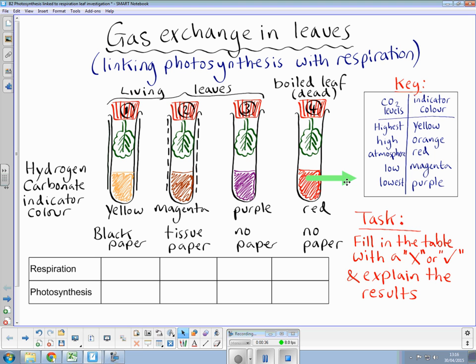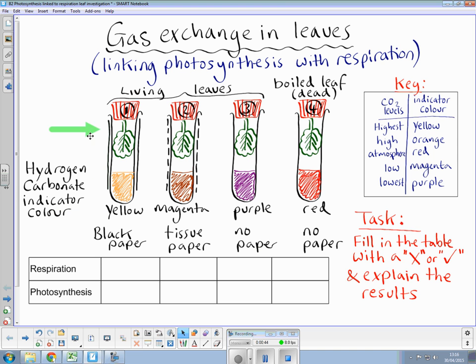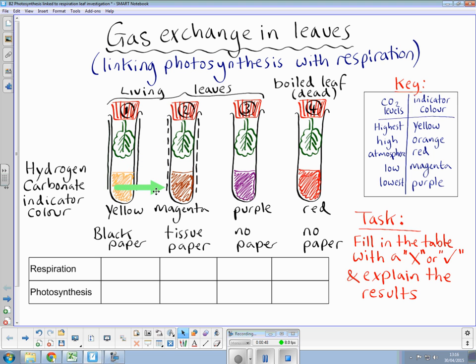Also, as another independent variable, you can see that the tubes are covered or not covered. So the first one has been covered with black paper all the way around. The second tube has tissue paper, as indicated by these dotted lines, and tubes three and four have no cover on them at all.